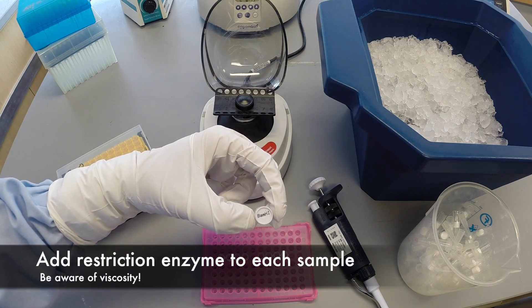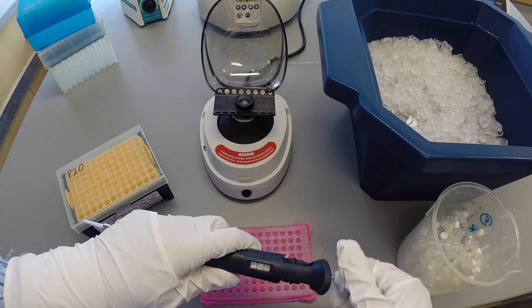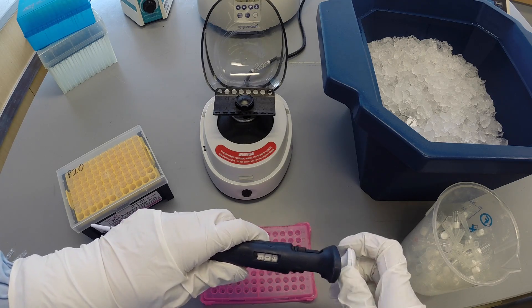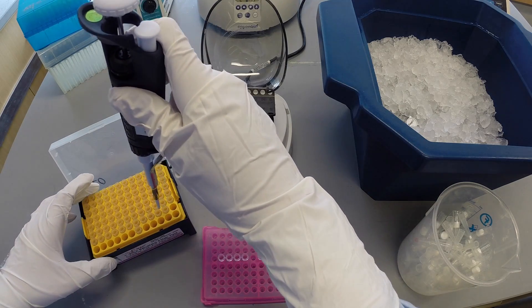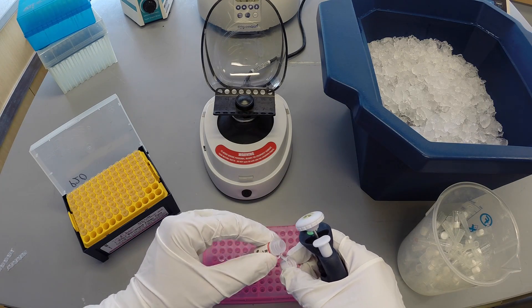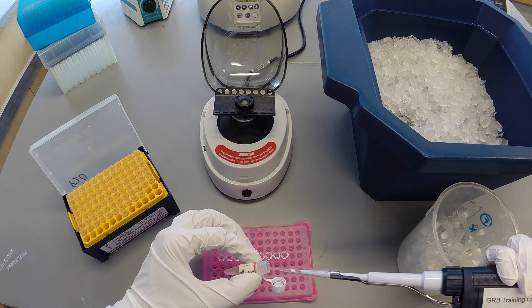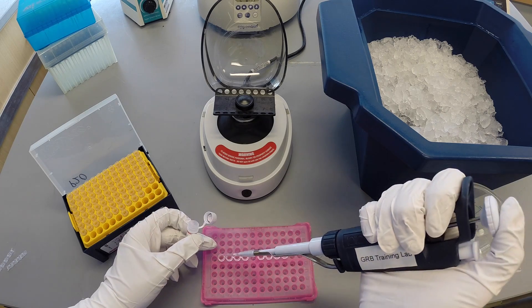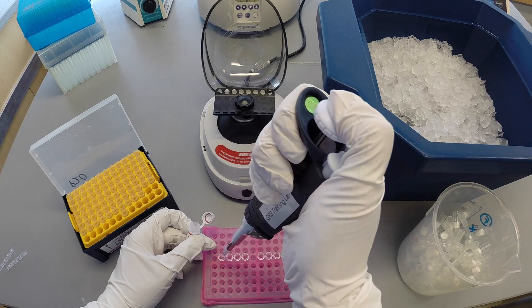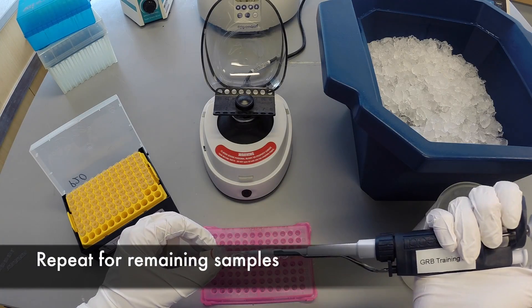Add one microliter of the restriction enzyme to each tube. Be aware of the small volume but also the viscosity of the enzyme solution. Enzyme solutions typically contain glycerol, a very thick solution. It will stick to the tip, which could cause the addition of more than is needed into the reaction. Wipe the tip on the edge of the tube before dispensing into your sample. Repeat this process for the remaining samples.